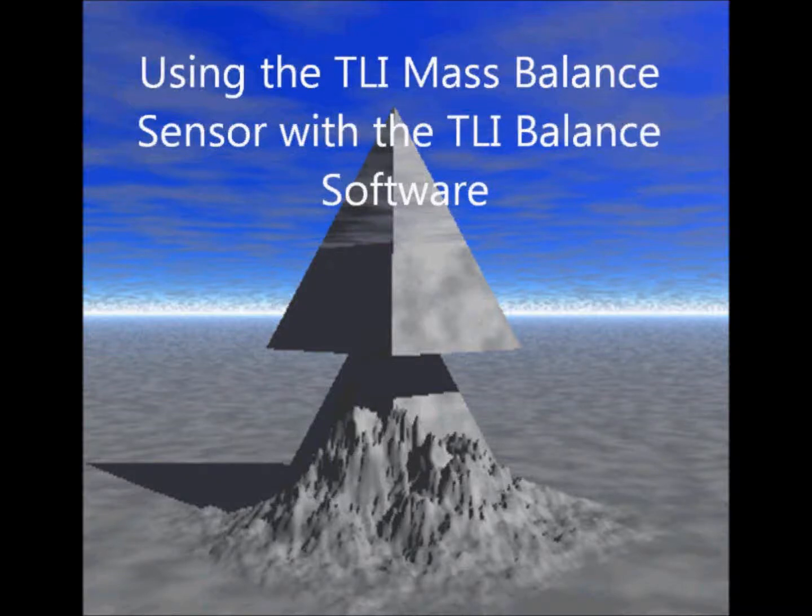Welcome to one of the videos in the TLI Mass Sensor Balance series. This video will explain how to use the balance with the TLI Balance software. I've ensured the balance is connected to the PC by its adapter cable and I have switched it on.